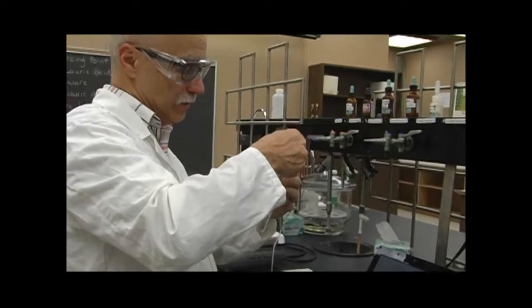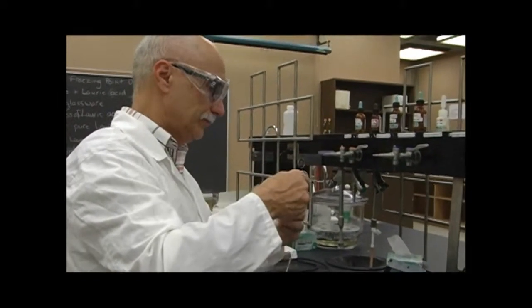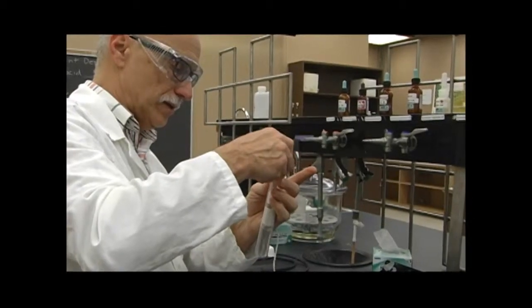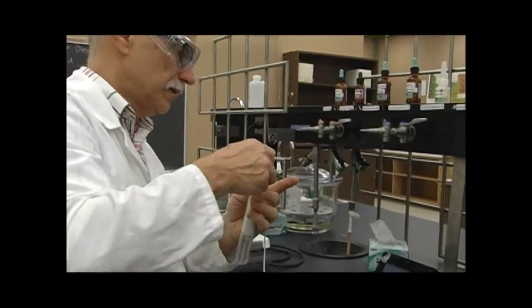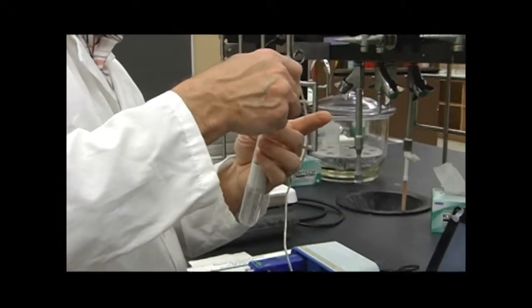Lauric acid is one of the main ingredients in coconut oil. So we have some slush here at 36.7, 36.8. So we'll see, keep that constant.